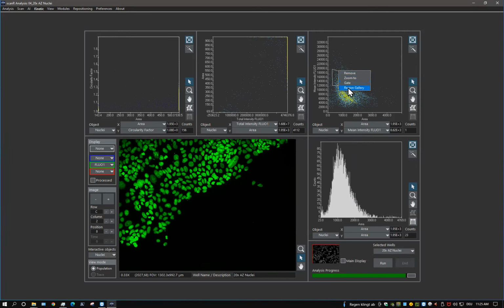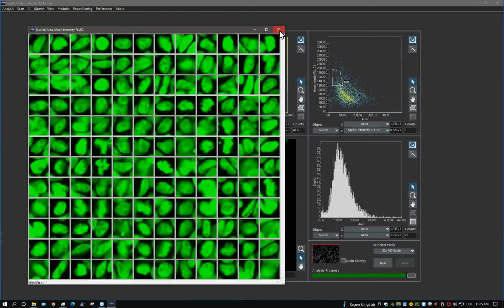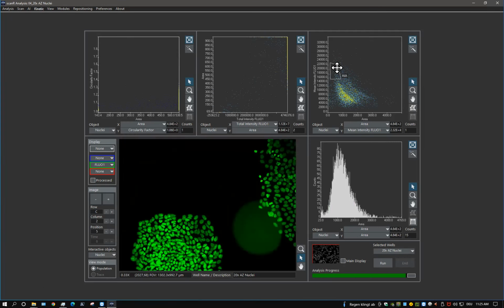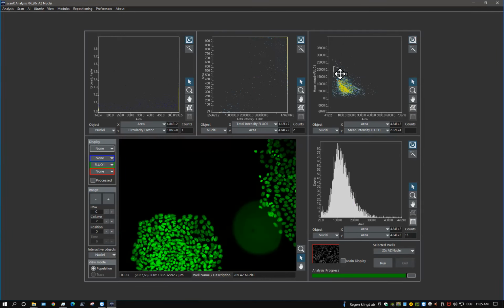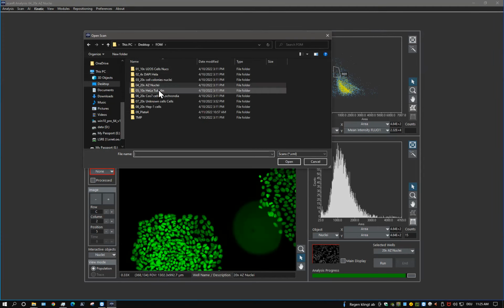And if I look here on the nuclei that just have undergone mitosis, or maybe shift this a bit, I think I picked too many, maybe here, and I see really the nuclei which are quite condensed and can be measured. Okay, let's pick maybe a more sophisticated example.